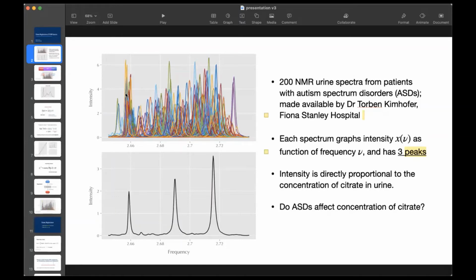But in terms of your question, for a real world data set, I would say this was probably slightly smaller. From other NMR data sets that I've seen, they can run up to the thousands of observations measured at tens of thousands of frequency points. Yeah, because the individual who made the data available, I used to work in the same center there, and some of the samples were much larger and some much, much smaller, but indeed there would usually be many more points of frequency than 500. But sometimes you only had 7 samples. Yes, exactly. Anyway, thank you.